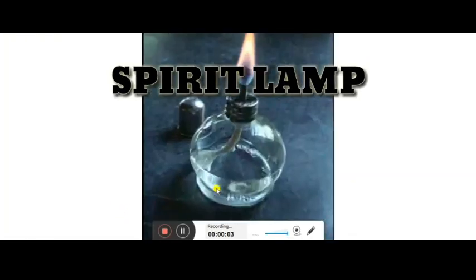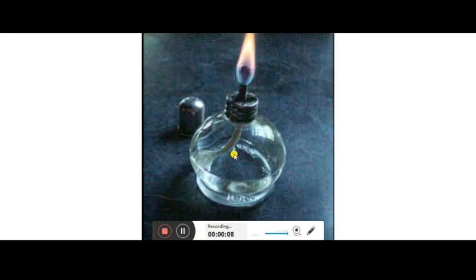Next is the spirit lamp. What is the arrangement of this? Basically it's a container inside, with a neck where the cotton comes out, and inside this the spirit is filled. The flame comes because of the burning of the spirit. Spirit contains alcohol and can burn very easily, so this is used for the heating process. The wick is there to soak the spirit and carry it to the top very easily. So this is the spirit lamp.